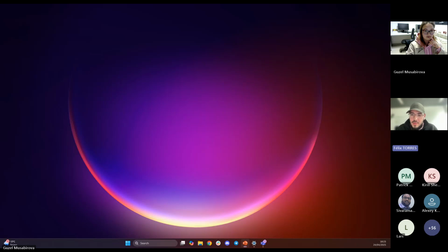And a question from Alexey Kiryutin: how long do you apply laser irradiation in your pulse program at slide 14 or 15? I would like to know as well. Thank you for the question. We tested different ways of how long we can apply laser irradiation. The optimum was found to be about half a second.